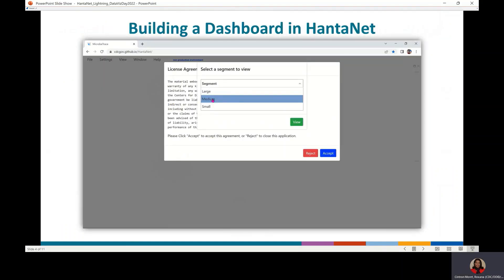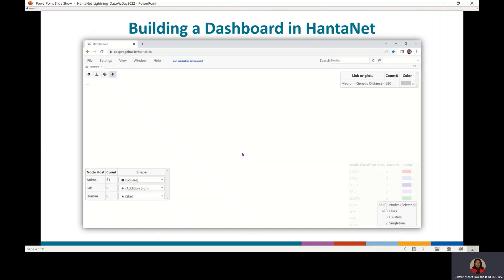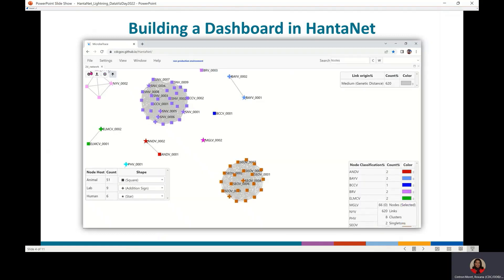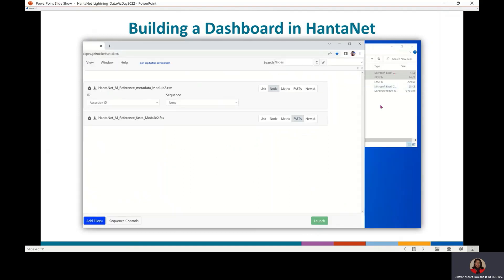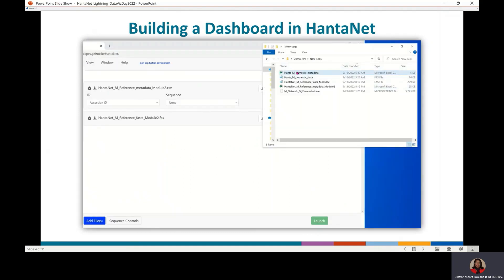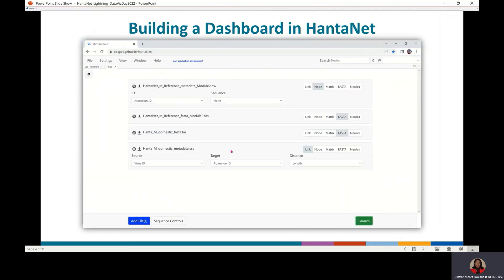I will demonstrate how to build a dashboard in Hantanet to analyze new hantavirus sequences. First, accept the license agreement and launch the module of interest. Load the metadata and FASTA files and make sure the correct file type is selected.